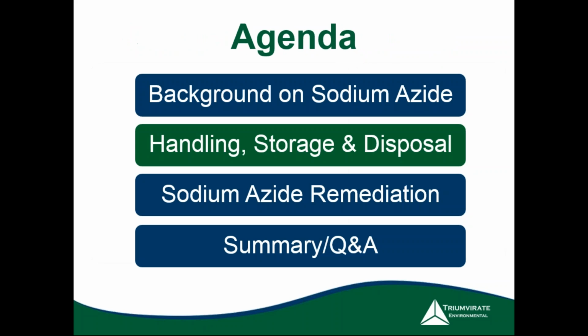So that's just a little background on sodium azide, what we're going to cover today. Another important thing to note is handling, storage, and disposal. So we'll get into that right now.